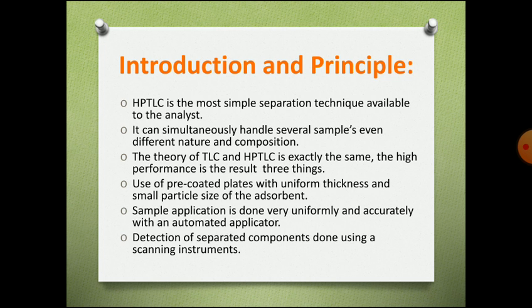Now we will see the steps involved in HPTLC. What steps do we follow when we do the HPTLC technique in sample analysis?